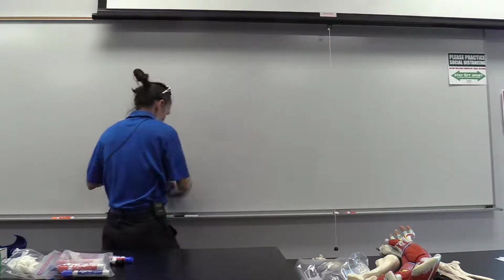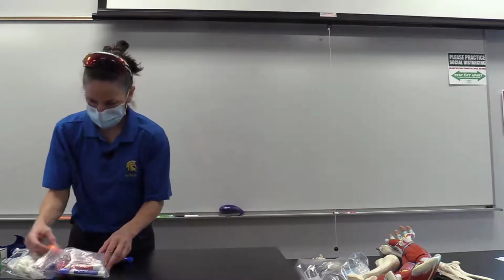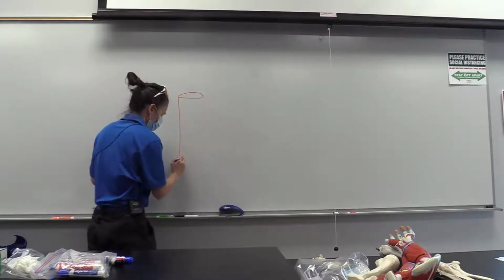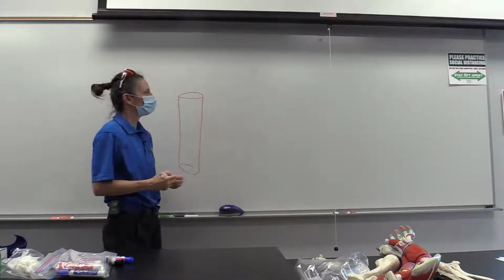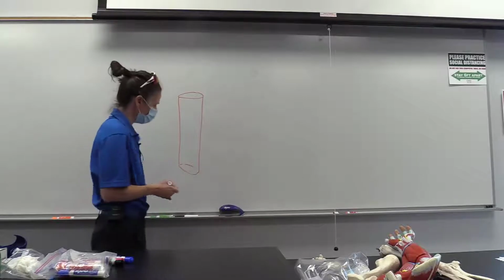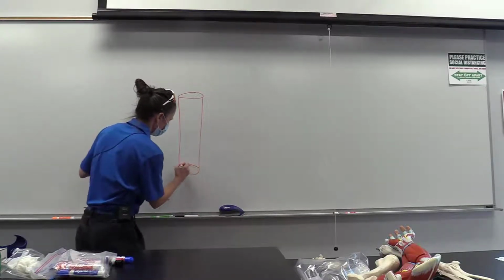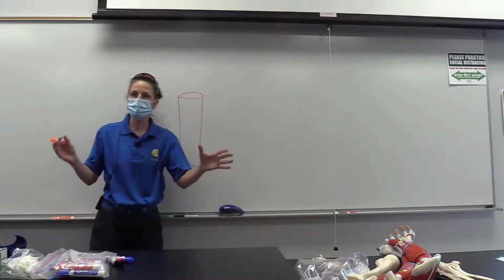Now, who watched the potato core experiment? Okay, so everybody knows we took some potato cores, and we basically took a cork bore and cut out some strips of potatoes. And potatoes have a fair amount of solute in them. They've got a fair amount of starch in them, right? And so what did we do? We cut these things. In the video, I think they cut them all equally to 6 centimeters, right? And then we put them in different solutions.